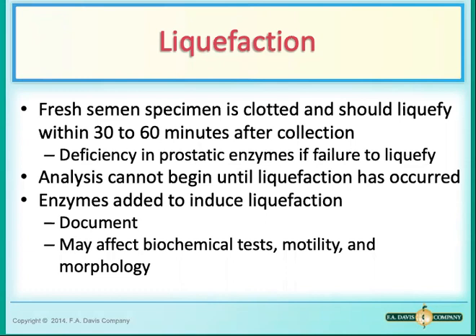Analysis of the semen actually cannot begin until your sample has liquefied. If 2 hours have passed and your sample is not yet liquefied, you could add something to it like Dulbecco's phosphate buffered saline. So you would take an equal volume of the semen and an equal volume of Dulbecco's phosphate buffered saline.